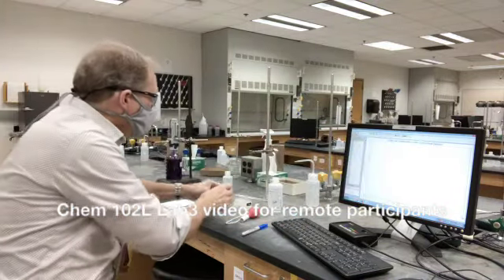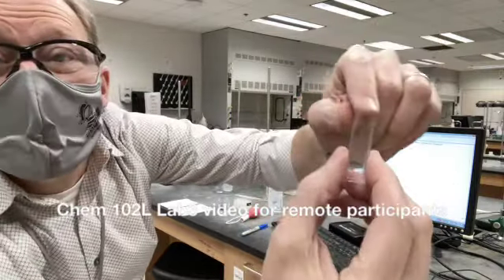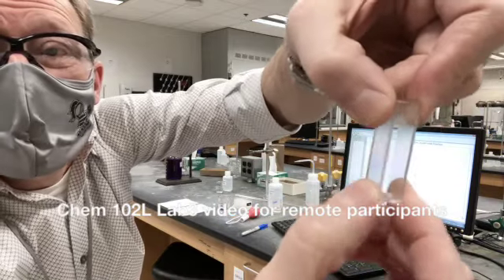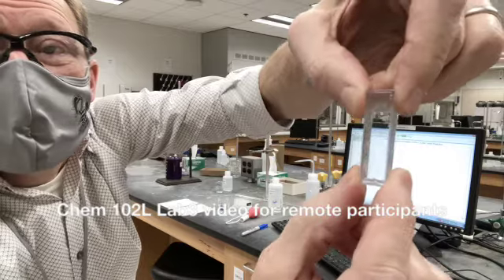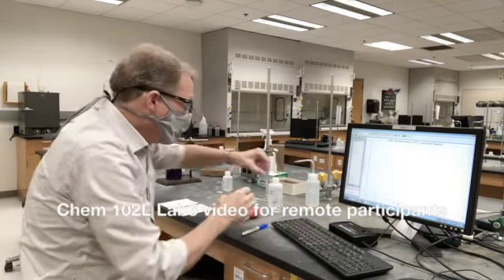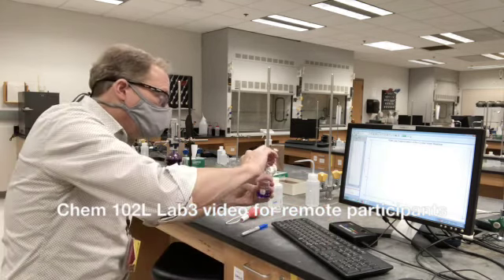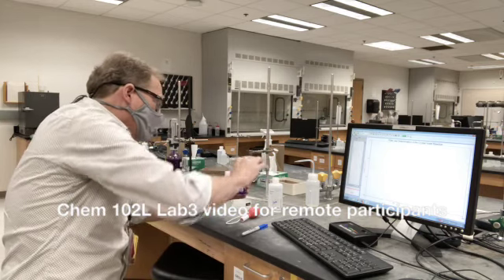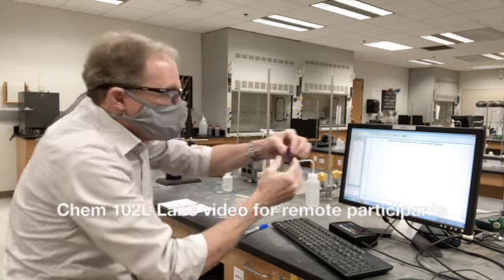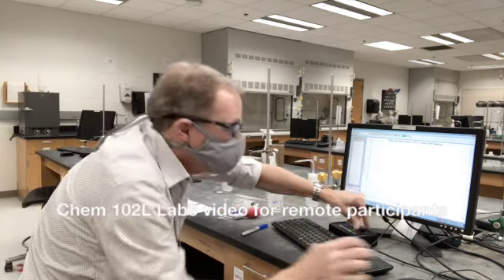I'm going to mix these, put them in a cuvette, and stick it in my SpectroVis Plus. There is a little triangle at the top and I can get that lined up with the triangle here. You'll notice that there are clear sides and translucent sides — the clear side is what we want in the beam path, which goes from the white light source to the triangle on the SpectroVis Plus. So I'm ready to mix. I'm going to pour one into the other and just back and forth — and now that is well mixed. I'm going to pour this into my cuvette, trying not to take too much. That's a good fill. I find my triangle, slip this in here, and I click collect.